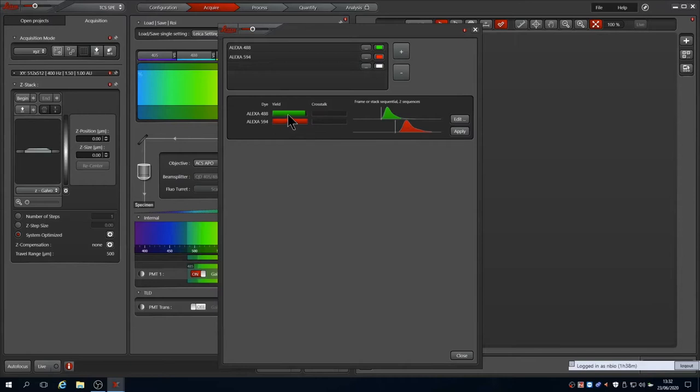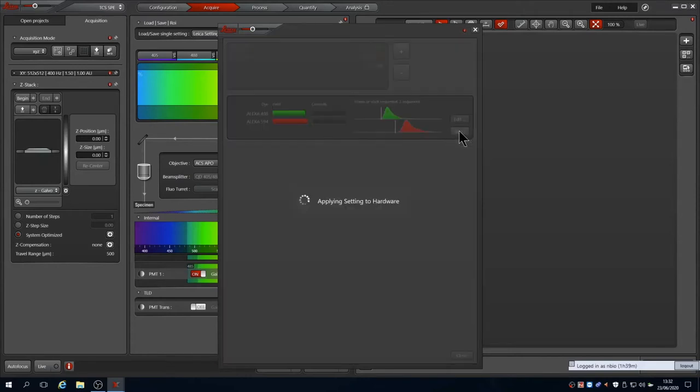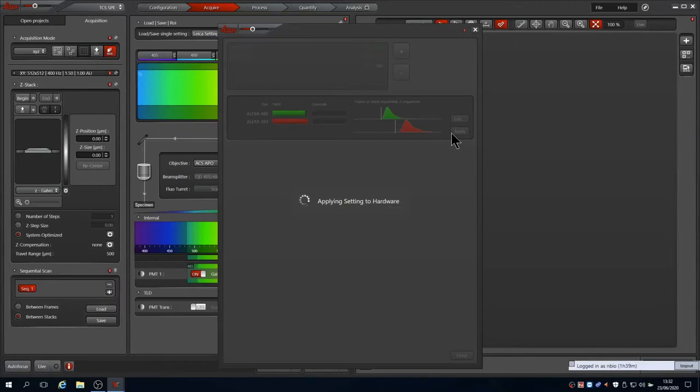The system calculates the best laser lines and capture band passes to be used based on your choices. It tells you how well the dyes are excited by the lasers and warns of any potential crosstalk that may occur if they are not well separated. Because this system has only one PMT, the images will be captured frame or stacked sequentially so that it doesn't have to move the band pass filters between every line, making imaging faster.